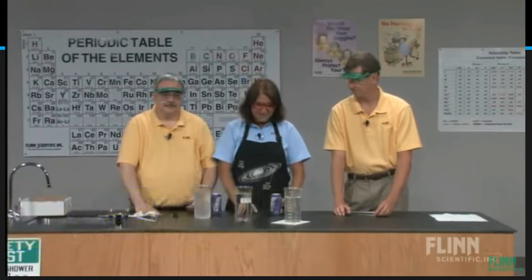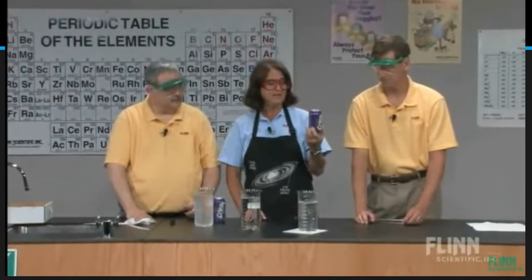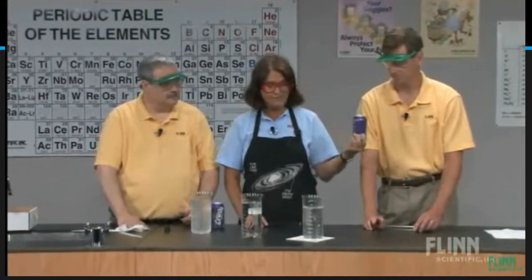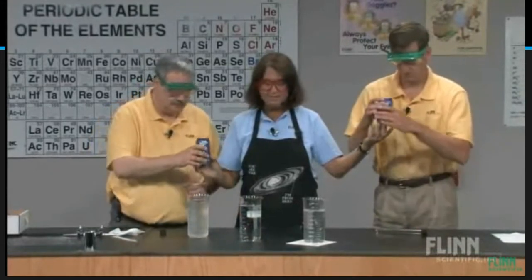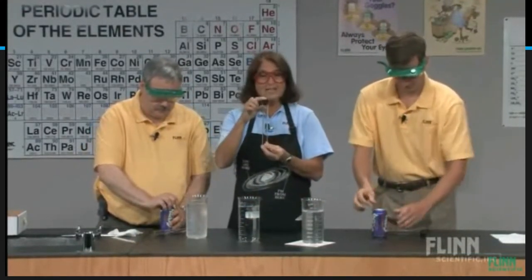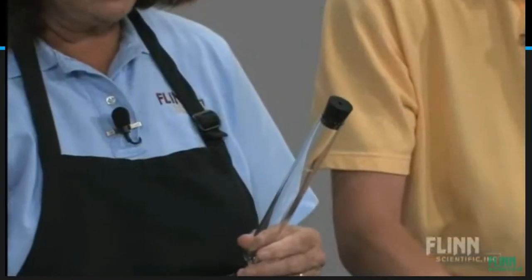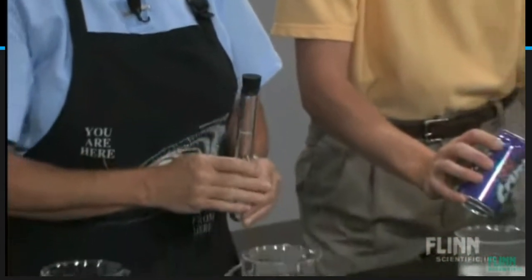We're going to do a quick investigation involving solubility of gases in a liquid. To do this, it works better if you use a dark colored liquid. So we've selected grape crush soda. Guys, you want to go ahead and open these up and start to fill your test tubes. We have identical test tubes with a 1-hole stopper here and 3 beakers containing water at different temperatures.